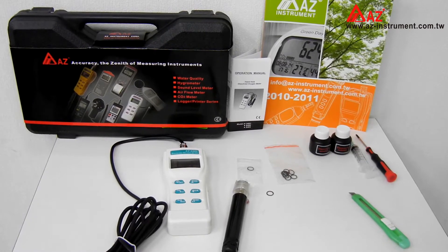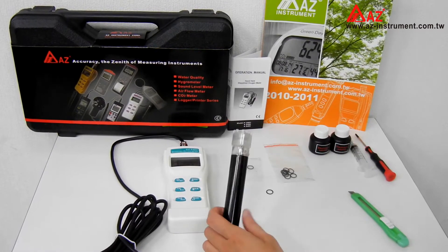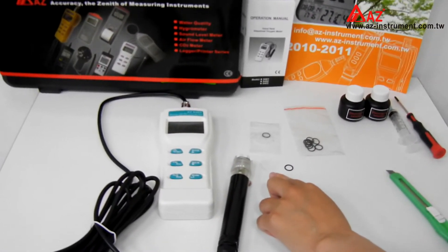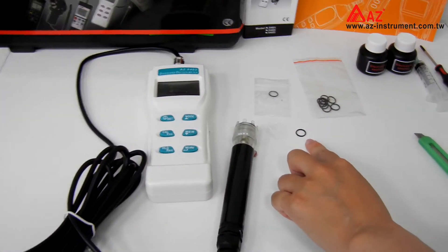I will be showing you how to replace the membrane for the AZ Dissolved Oxygen Probe. The materials you need are the new membrane and O-ring, which are included in the standard package.